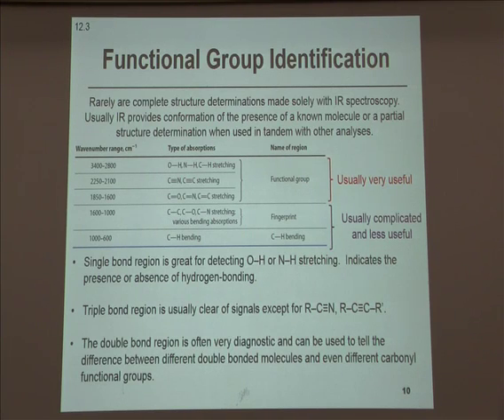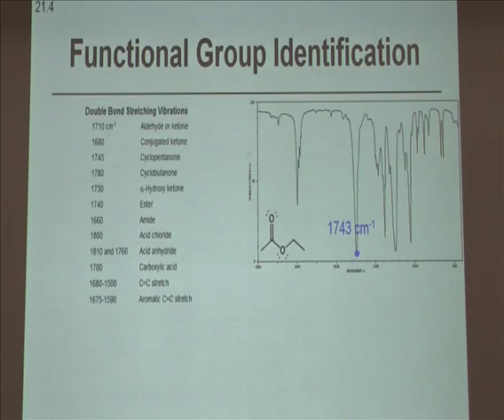And we can do that by having a bunch of previously determined typical regions based on what functional group created them. These are all experimentally determined or empirical observations. None of these values is absolutely representative of all stretches for that functional group, but often pretty close.